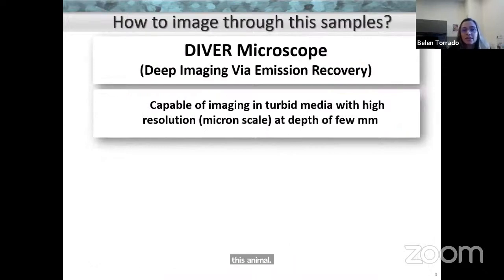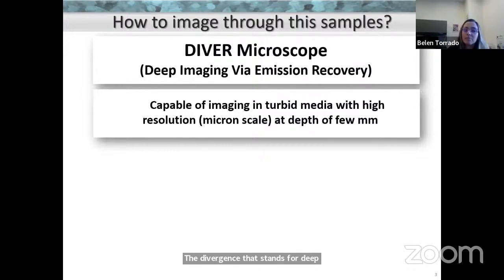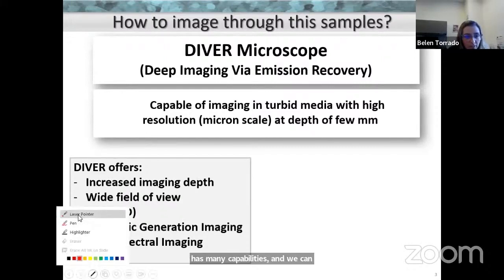So how to handle these samples? Well, the LFD developed the DIVER, that stands for Deep Imaging via Emission Recovery. It's a microscope that is capable to image in turbid media with high resolution and in depth of a few millimeters.